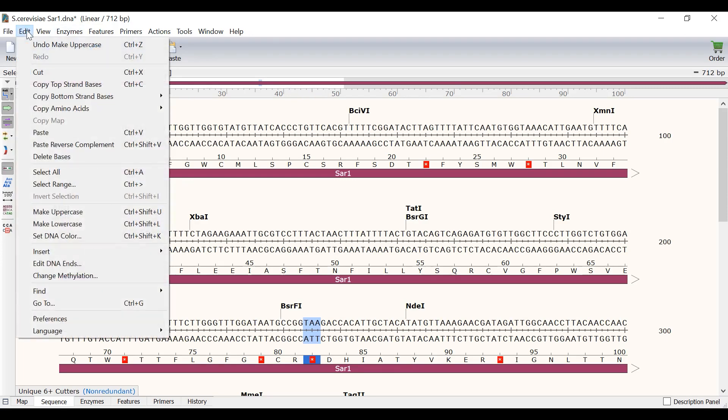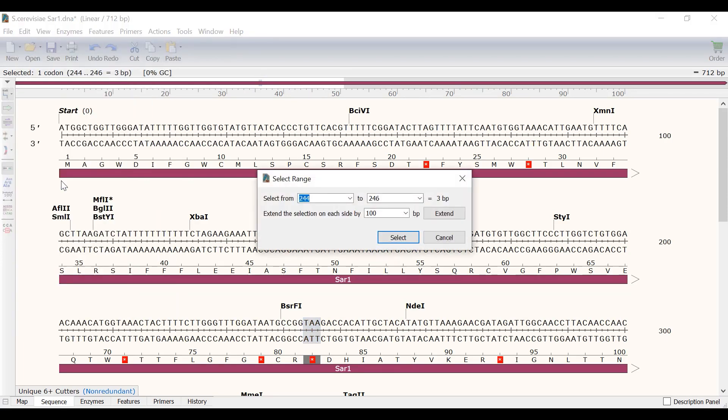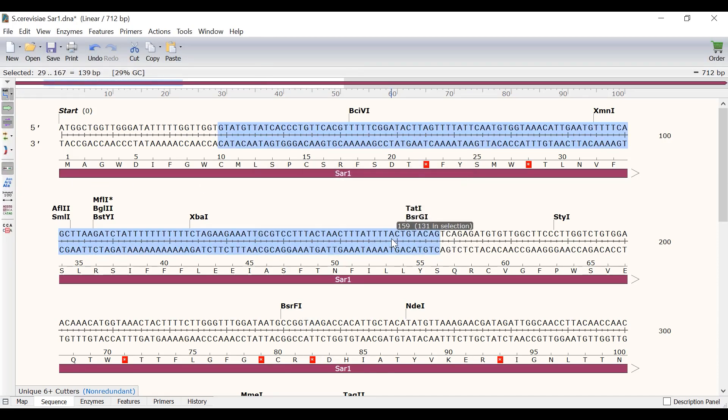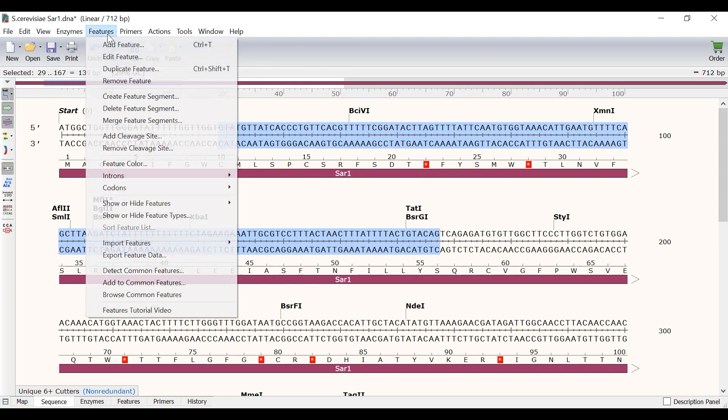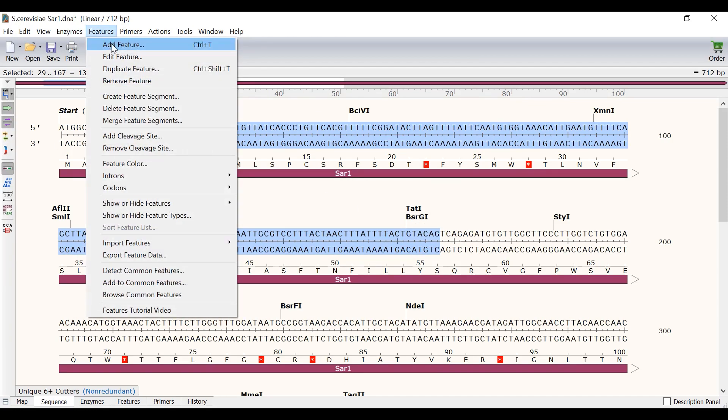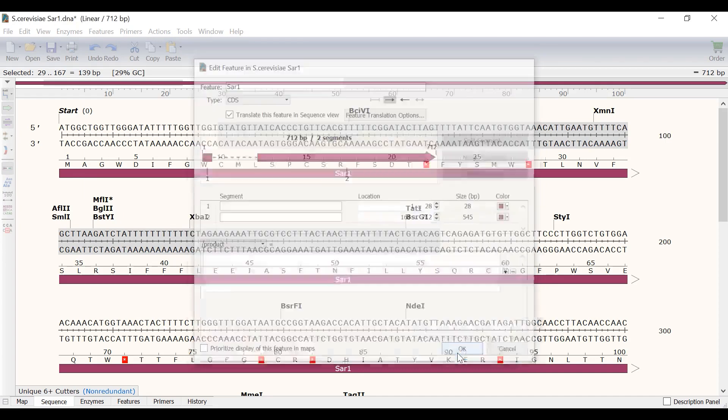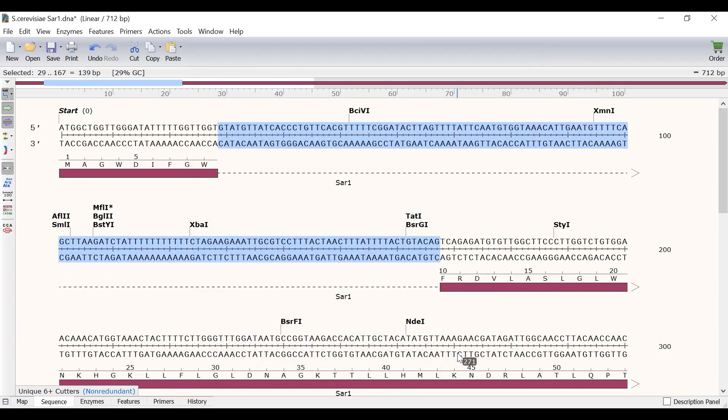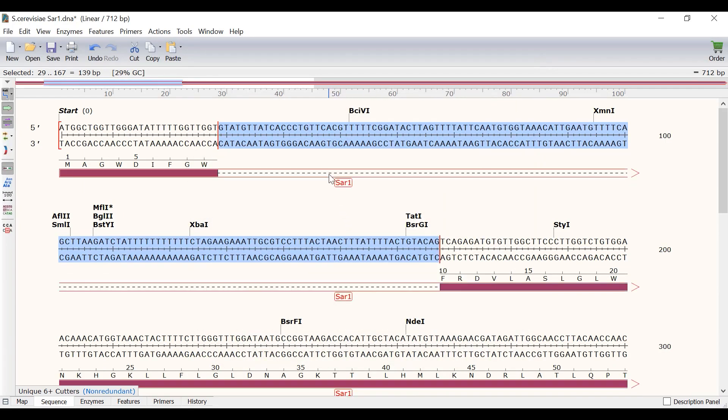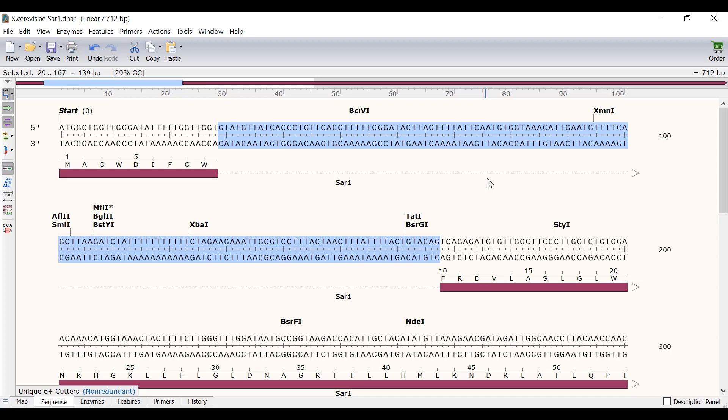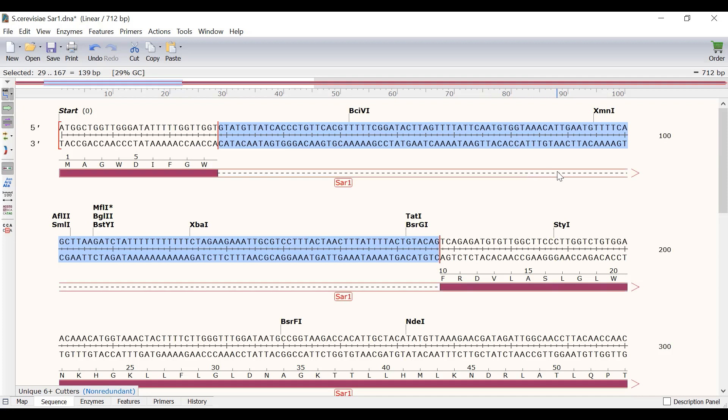So I will go to edit, select range and specify the bases 29 and 167 to select this sequence. To remove this segment from the feature I will go to features, delete feature segment. When the edit feature window appears I will click ok to return to the sequence. The dotted line between the feature arrow now indicates the intron.